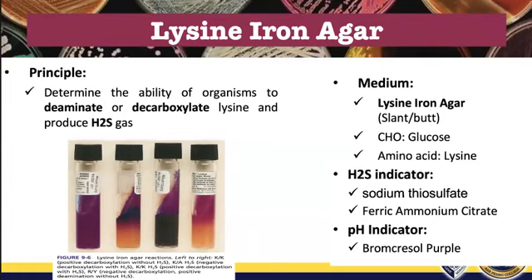And then, that would also be the time that the decarboxylase enzyme wakes up to reduce lysine into cadaverine. So when cadaverine, which is an amine, is released, it would change the color of the media back to purple. So positive for decarboxylation is purple.